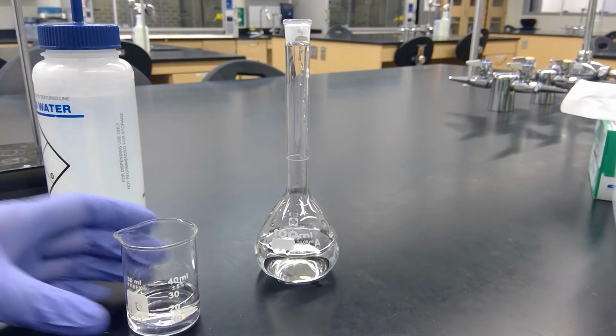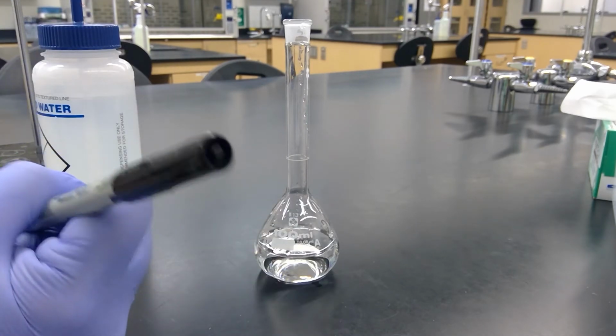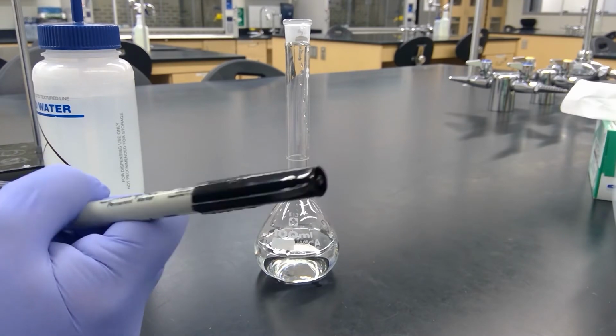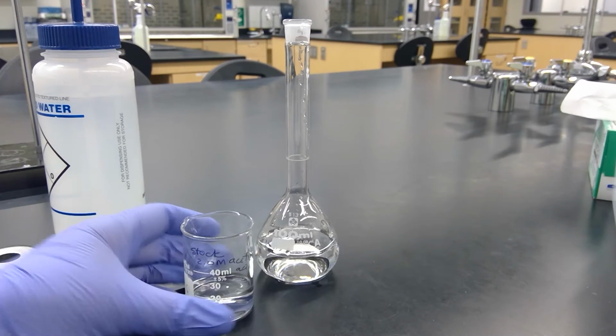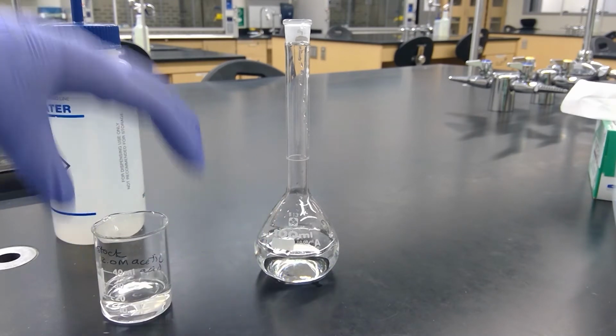So I'll label it. Because it's a clear liquid, so it looks just like water, and we might mistake it for something else.